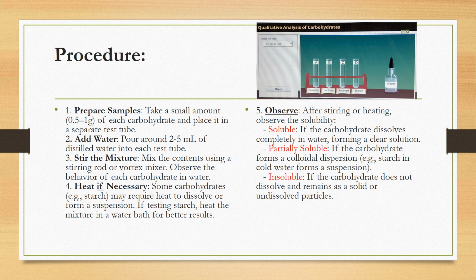We place 0.5 to 1 gram from each sample inside the test tube as in the picture. And we must label each tube to identify the sample.